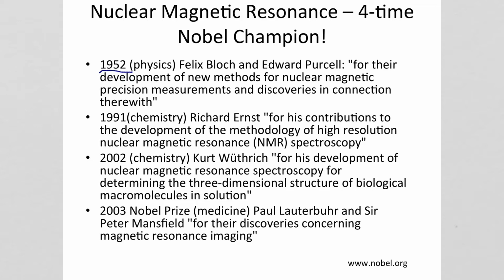In 2002, Wuthrich won the Nobel Prize for looking at large structures. So this is the 3D structure of biological macromolecules in solution. So that's a big leap from looking at small molecules like, say, phenacetin or acetanilide or dichloromethane to looking at molecules like, say, the protein insulin or something like that.